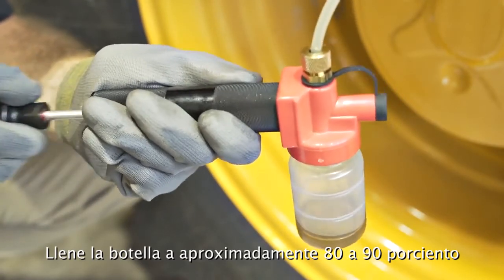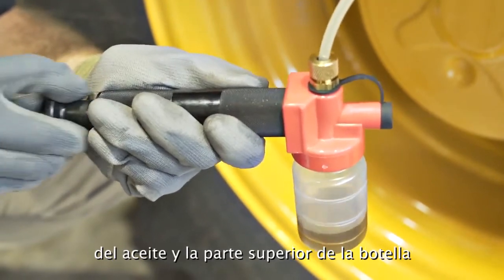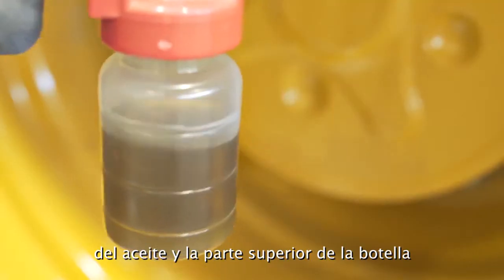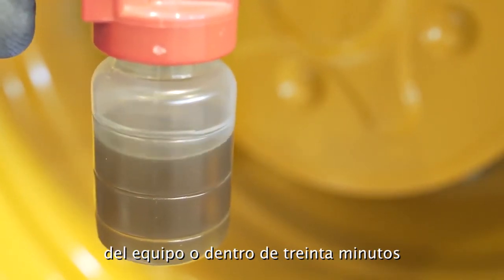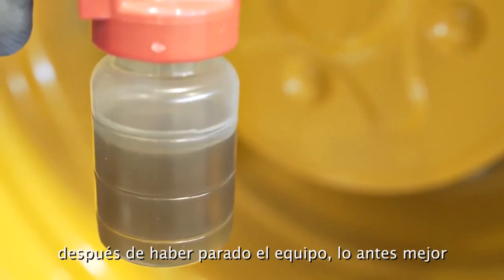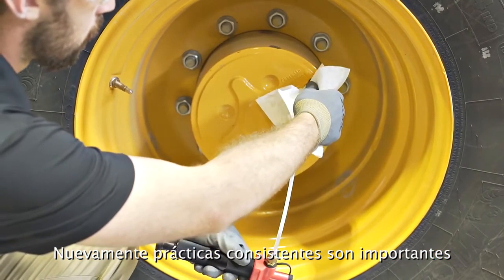Fill the oil sample bottle approximately 80 to 90% full. Leave some airspace between the top of the fluid and the top of the bottle. Obtain samples during normal equipment operation or within 30 minutes after equipment is shut down. The sooner the better. Again, consistent practices are important.